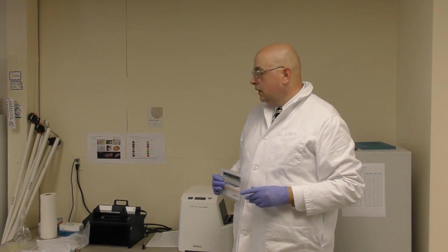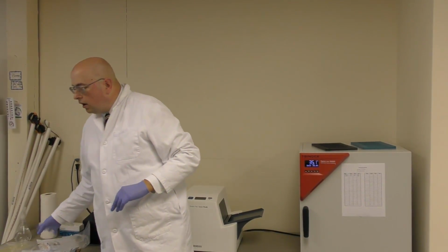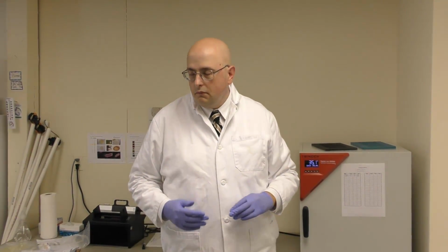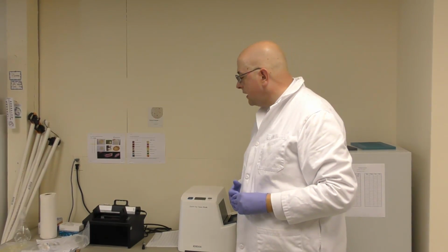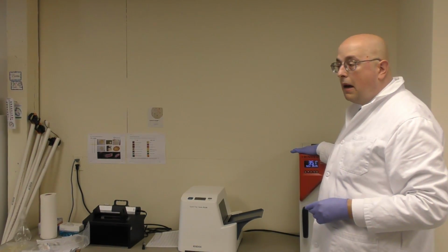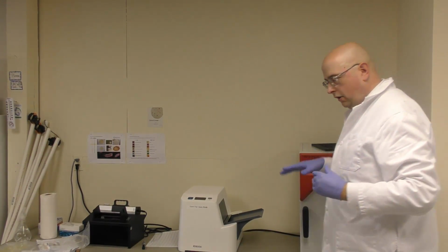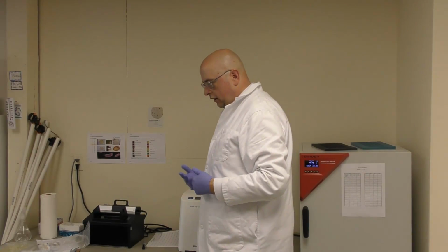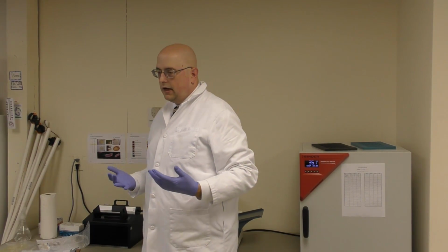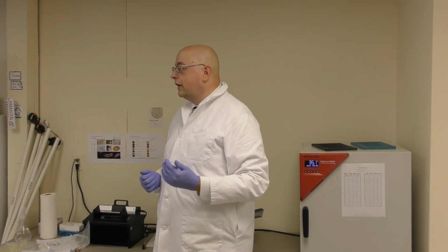Okay, so that's about it for the quality assurance for the laboratory side of things. Again, because you have the incubator and we have a secondary thermometer in here that takes care of all temperature issues. We don't have to autoclave anything, so we don't have to check our autoclave to see if it's properly sterilizing anything. So it's very minimal what's required to confirm that you got a good sample. So that's pretty much it.